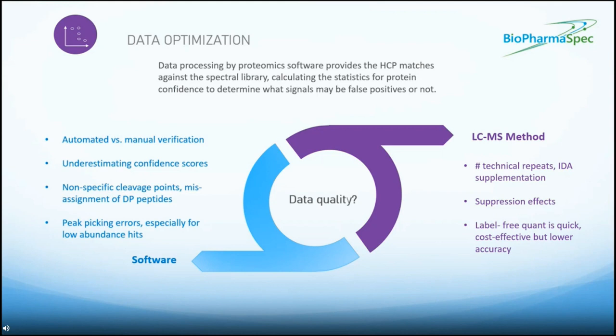Another is whether you have supplemented the base library with sample IDA to account for any HCPs missing from the library, and to avoid further false positive results, for example, or missing something altogether, as I said. So again, there's more time involved in this process, but there will be higher confidence in your data.